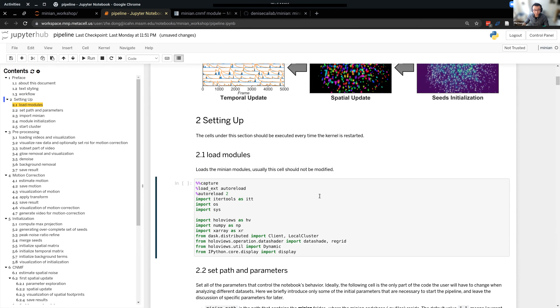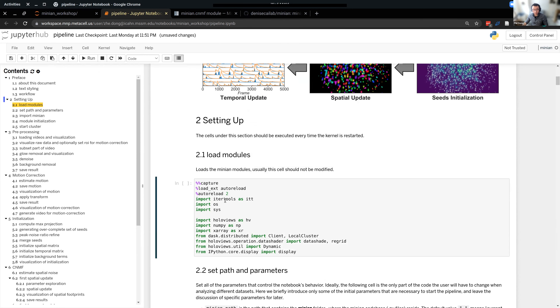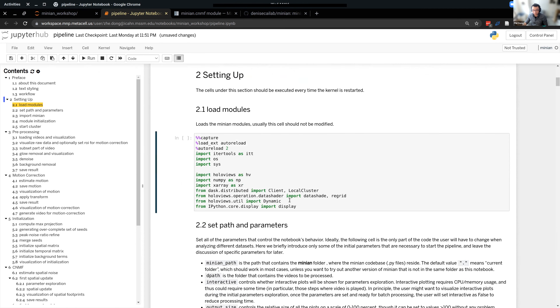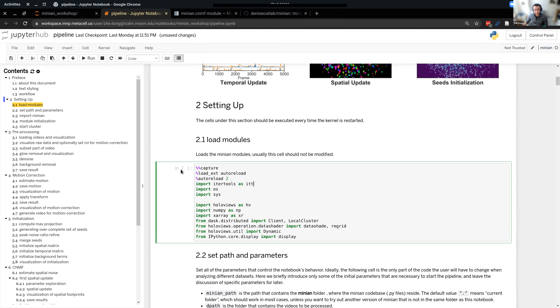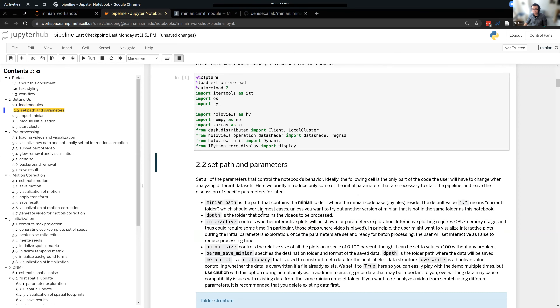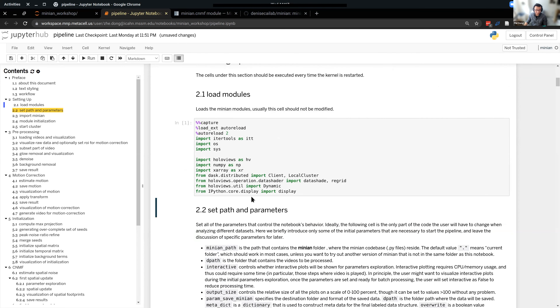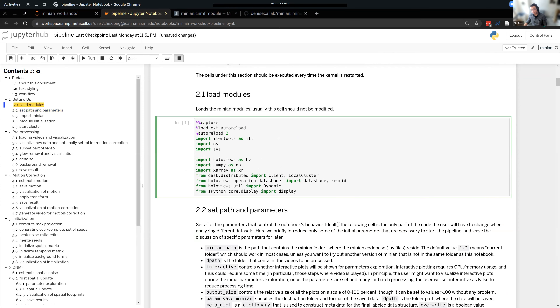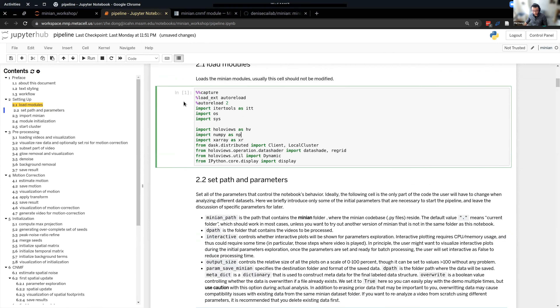To restart the kernel — for example if your session is all messed up and you want to start clean — go to Kernel and select 'Restart and Clear Output', then confirm by clicking the red button. Now you have a fresh kernel and all cell outputs are cleared. To tell whether a cell is still running, look at the little bracket next to the cell. If it's empty, nothing has run. When running, it shows a star. When it becomes a number, it's finished. Don't interrupt a running cell without good reason.